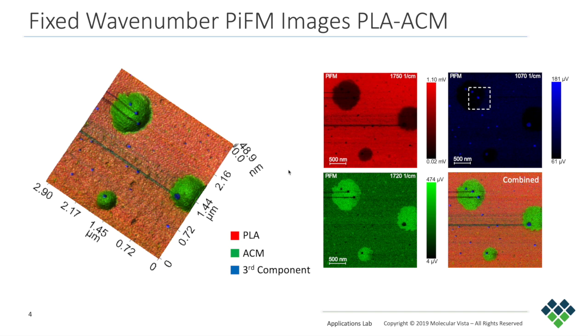All right, let's take a quick minute to review the data that we just analyzed in Surfaceworks. Surfaceworks has a really powerful feature in that it allows us to directly export the images that you were seeing in the Surfaceworks package directly over to other software packages. So Microsoft Word or Microsoft PowerPoint programs, no problem, just a quick copy and paste. Same for OpenOffice, we're able to do that same copying and pasting.